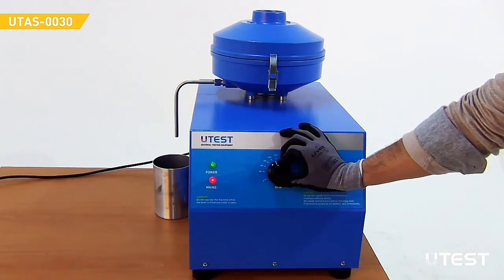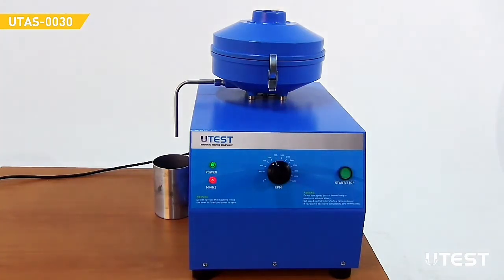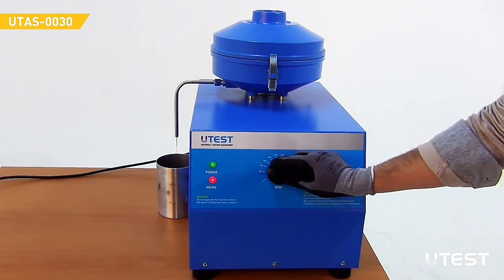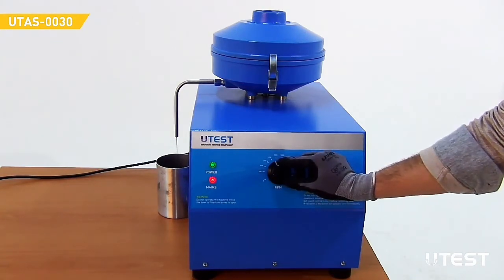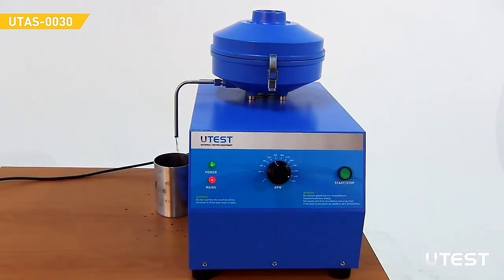Preferably run the centrifuge at three different speed levels. First, run it slowly at 1200 RPM for five minutes. Then increase the speed to 2400 RPM and run it until the solvent drain gets very low. Finally, run the device at full speed until there is no drainage.